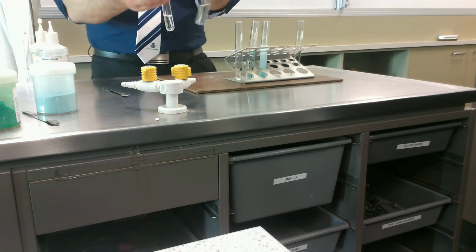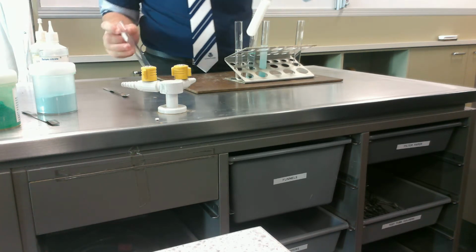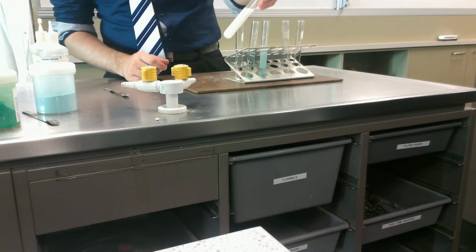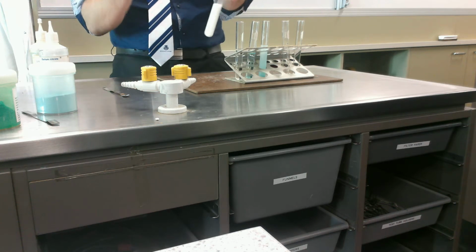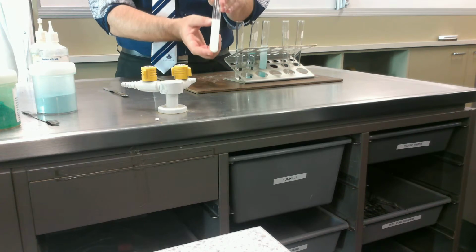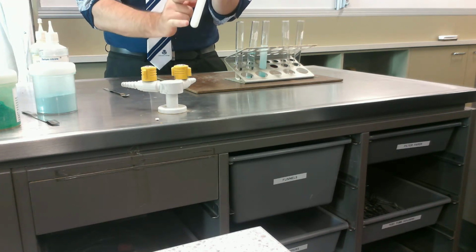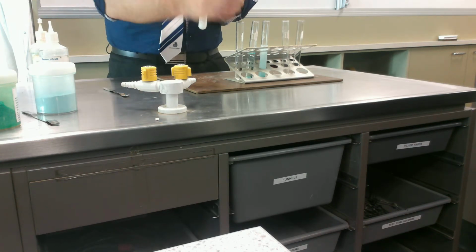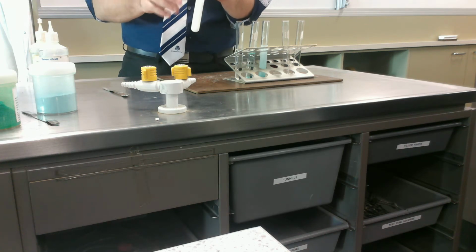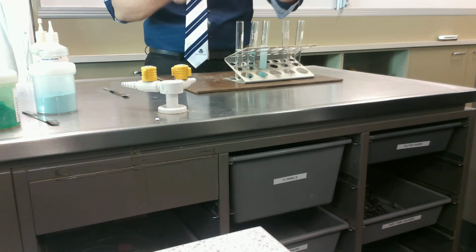But if I combine the two together, and I'm hoping this will show easily on the video, it goes murky, doesn't it? So I started with two solutions, but I ended up with a suspension. Whenever you add two solutions together and it makes a suspension, we call this a precipitation reaction. And that's what this week is about, learning about which reactions make precipitates and which ones don't. And that will be part of an assessment later in the year, or later in the term. We have to say, oh, I reckon a precipitate will form because. Okay, and I'll help you with those reasons.